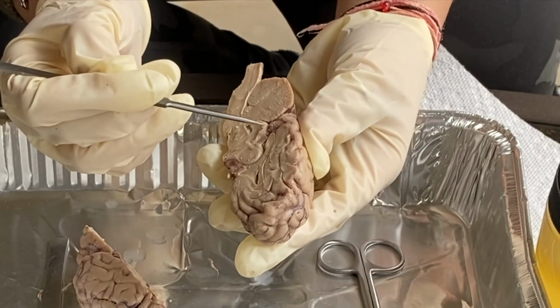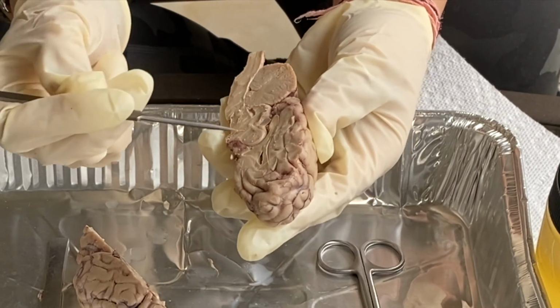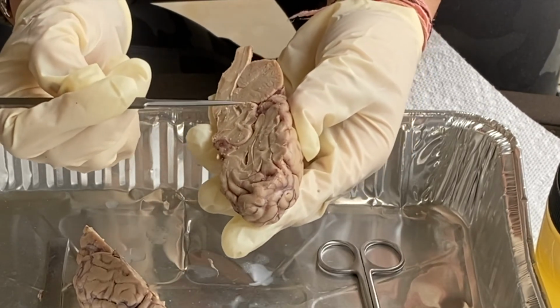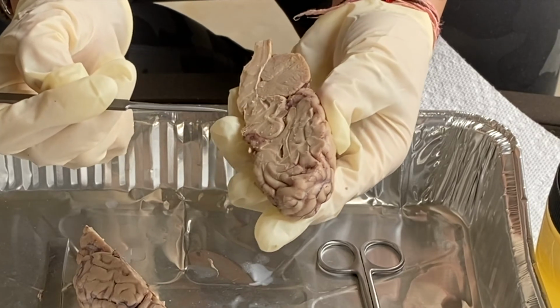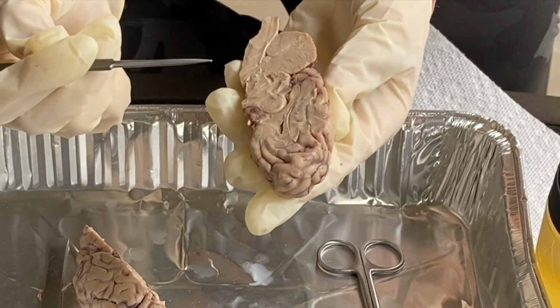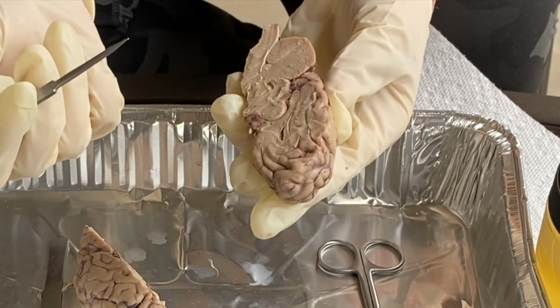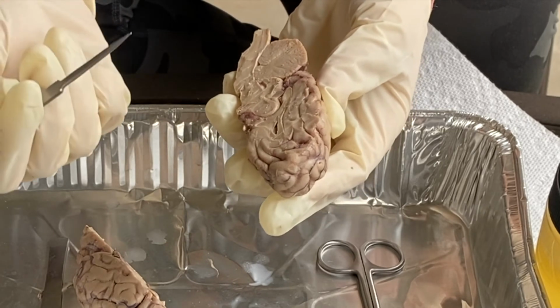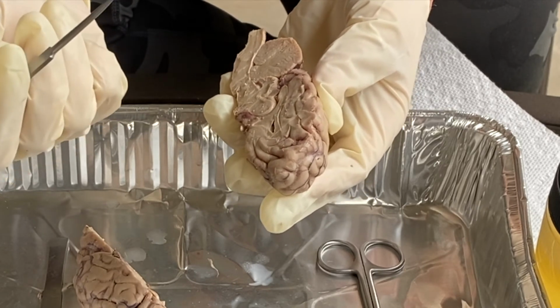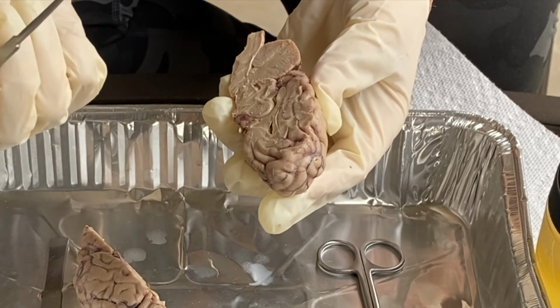Colliculus here. And the superior colliculus is a structure that's part of the midbrain, and it is basically a circuit for the transformation of sensory input into movement output. Its major function is basically orientation, specifically eye movements to objects of interest in the visual field.